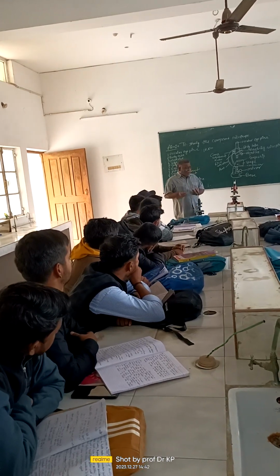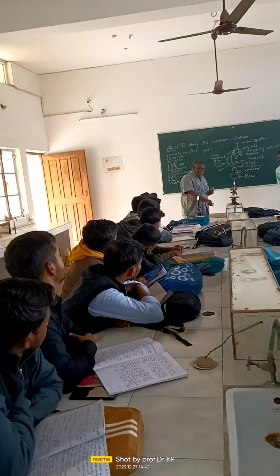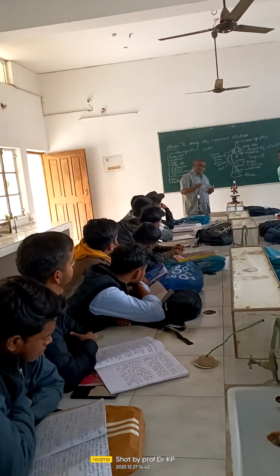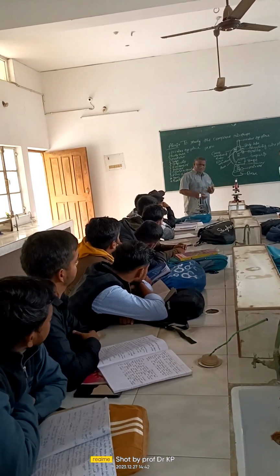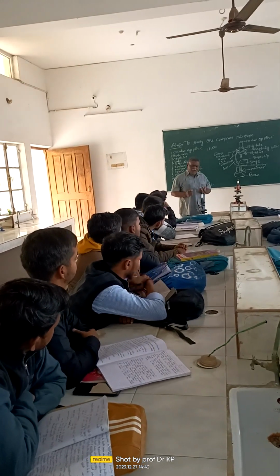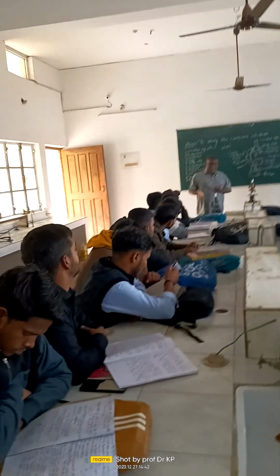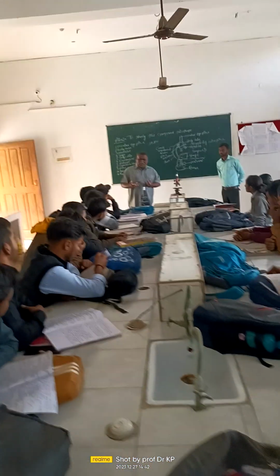Clear? So you are just placing one drop of the substance, or the structure mixed with the solution. You will select the solution as per the structure you are seeing, or as per the contrast you want to give. Right? If the solution has a chemical property, it will give a particular color to the structure. It will be easy to read.